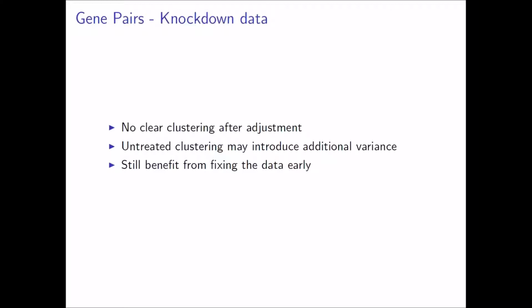I think there are some benchmarks that might be able to be done. And what I'm currently working on is identifying, is there a way to methodologically adjust some of these data and identify flipped points and bring them back into a more reasonable spot.